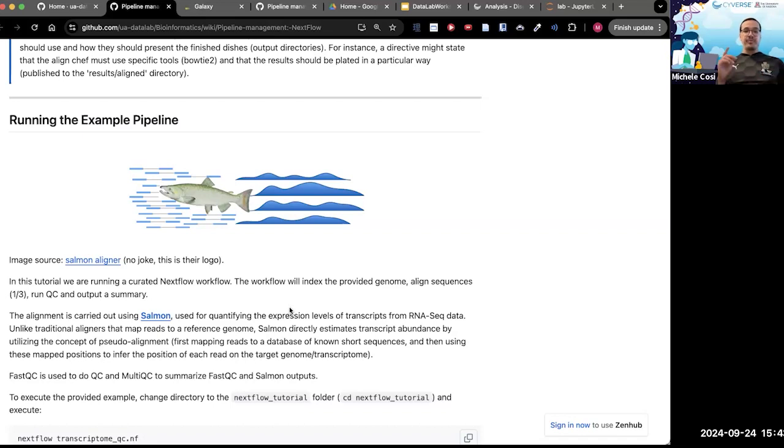I do also need to mention beforehand that this workshop has been heavily inspired. I took a bunch of data from Nextflow and essentially made the workflow in 1 hour. I think their time is roughly 3 hours, and that's why things feel a little bit rushy. Regardless, I did need to mention that there is a link to the entire workflow later on.